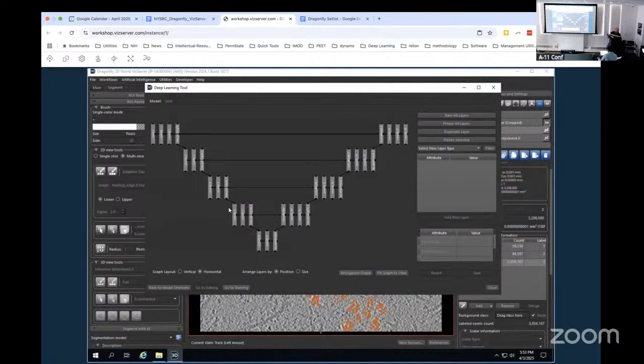You can see the descending branch, the encoder versus the decoder branches and so on. If you really want to, you can go in here and edit through visual means every layer and every kernel within every layer. I'm just letting you know, it gives you a lot of control if you want it.